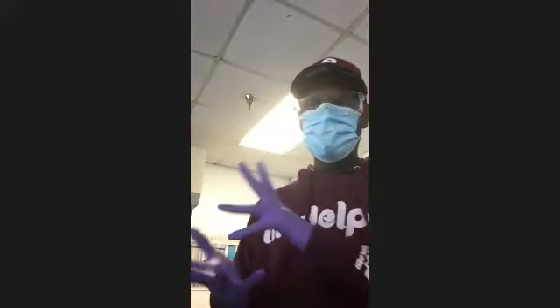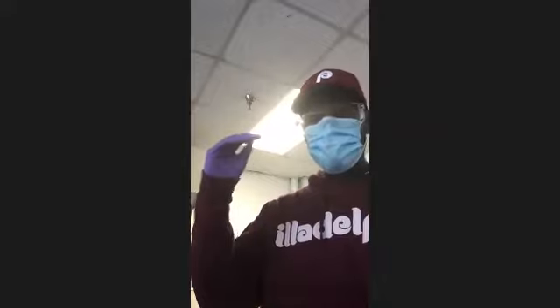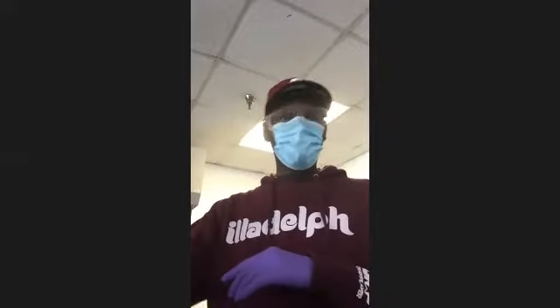So make sure you get that handout. It's in course documents, lab weekly experiments. It's the very first PDF document. Make sure you get that and fill it in, because when it's time to turn in, we're not doing a lab notebook. Everything is going to be electronic. So you're going to have a document just like this when we do the recrystallization part. Fill all the numbers in, and when we get the crude yield, which we'll get next week, you'll write the mass down, then we'll purify, and then come back and get the pure yield, and then you can get your percent yield. All right.